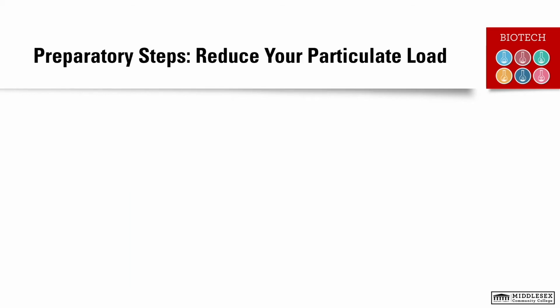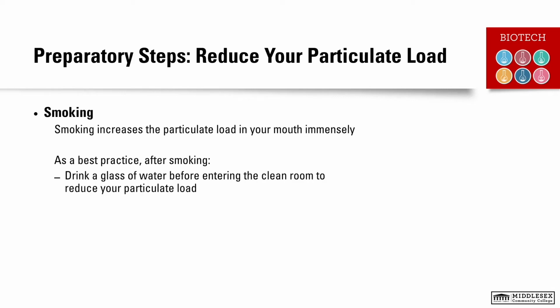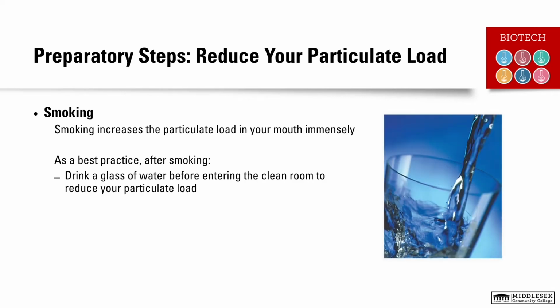Smoking increases the particulate load in your mouth immensely. As a best practice, after smoking, drink a glass of water before entering the clean room and possibly wait for 20 minutes in order to reduce particulate load.